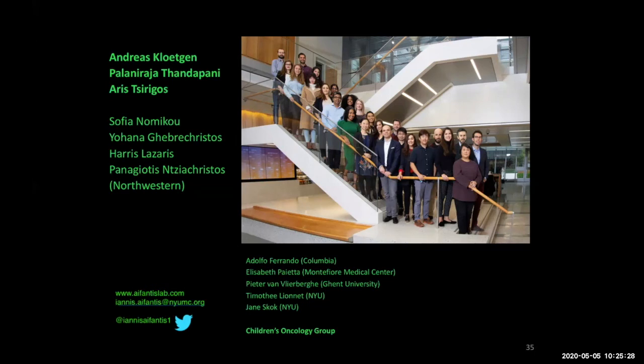A question here from Bogdan. Is the TAD calling or the TAD differential analysis impacted at all by underlying copy number variants or structural variants in the ALL cell? That is a great question. That's another month-long work that Andreas and Aris have done in the lab. So we have been through that.